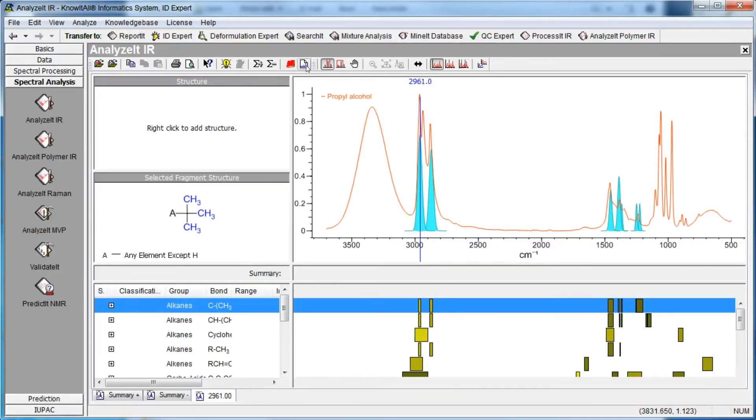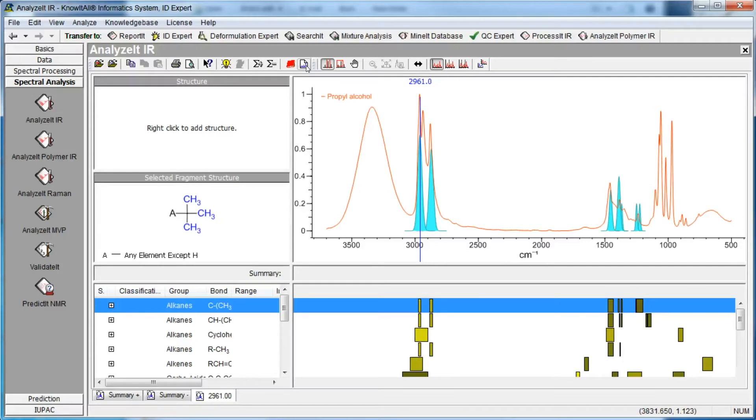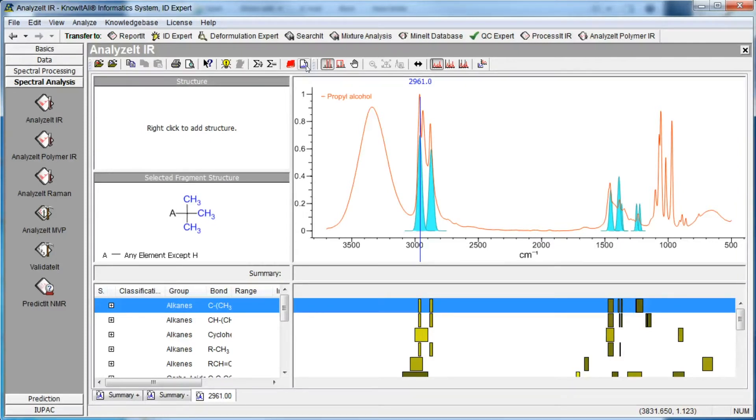The functional group data pane shows text data, bond, range, intensity, etc. for each functional group and corresponding information is graphically displayed in the bar chart pane. Click the plus sign next to a functional group to see a complete listing of the information available for each band.